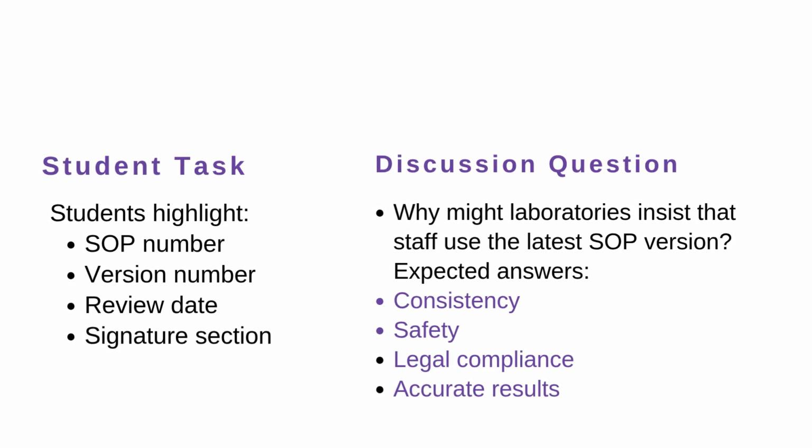These details help ensure that staff are following the most up-to-date procedure. Laboratories require the latest SOP version to maintain consistency, improve safety, meet legal requirements, and ensure that results are accurate and reliable.